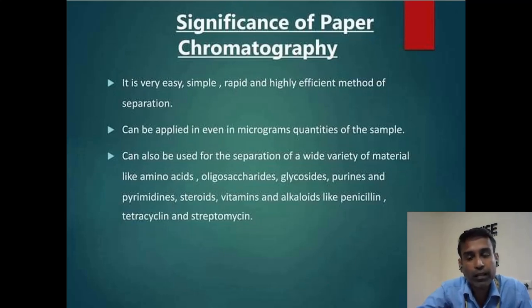Mostly paper chromatography is preferred for laboratory applications. But for R&D purposes, nowadays most food industries prefer advanced equipment like thin layer chromatography, gas chromatography, and high pressure liquid chromatography along with mass spectroscopy. They prefer these for a better understanding, to assess the quality of the food product and identify any adulterants present in it, to meet the legal compliance requirements of food products.